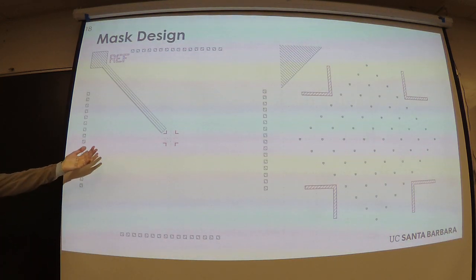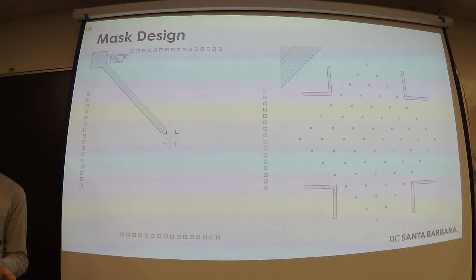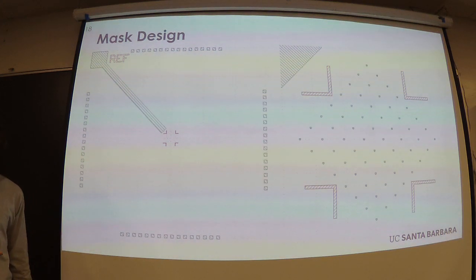This means we need to go back to the photolithography tool, design another mask. This time, we just want these bond pads over here, the reference electrode, and little openings for the electrodes themselves. You can see in this close-up, it may not be apparent from this image, but these holes are actually slightly bigger than the electrodes themselves, so that when you try to line this up, if there's some small misalignment, you can still get a good device where all of the electrodes are actually open.